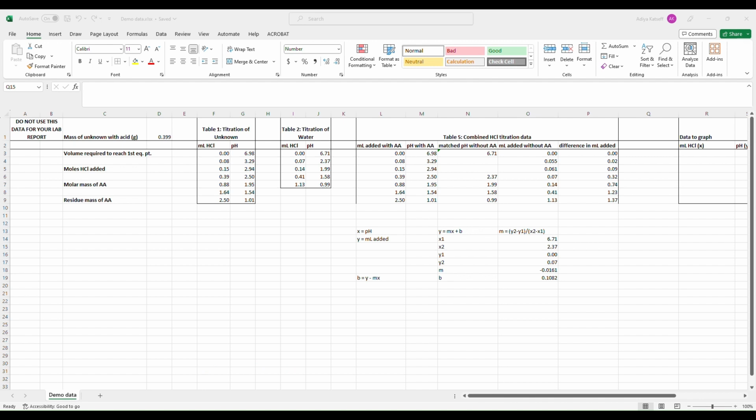So we're going to start from 0 and we're going to go negative. When we add in our NaOH data, which I'm not going to show you right now, but which you will do when you're doing your calculations, you'll keep those numbers positive and those numbers will go to the right. So right now we're looking to make a titration curve that kind of looks like this left-hand side of the graph. So our x-axis is the volume added, our y-axis is the pH that we measured, and hopefully now we can fill in some points on this graph.